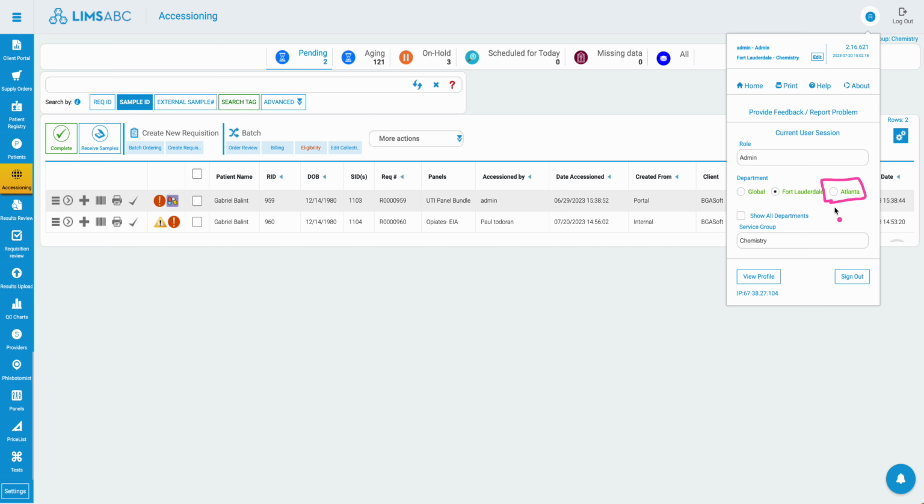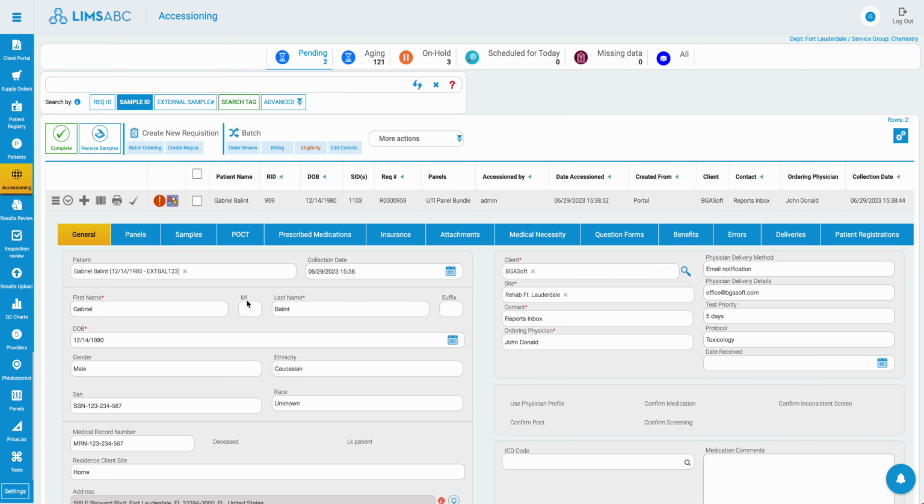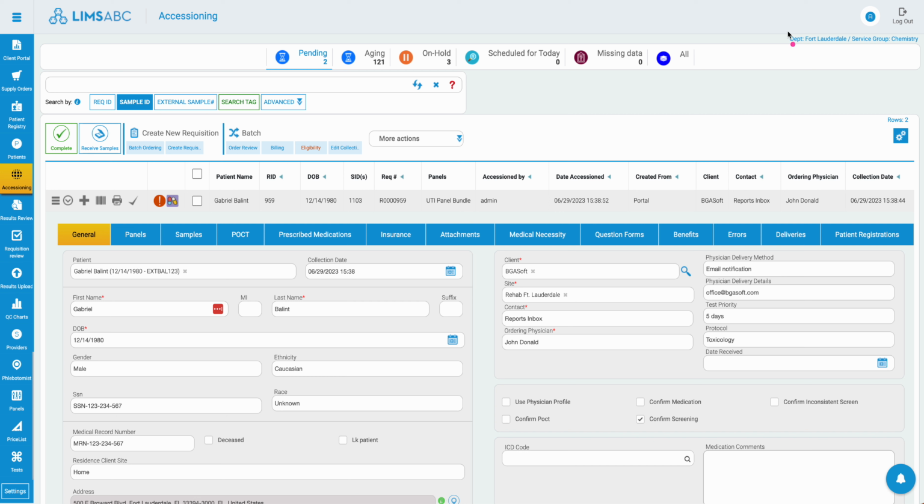So this is an easy way to control that aspect. And this is something that, like I said, we can set up based on different rules automatically, or the user can change manually. If you need to have this functionality, billing interfaces and reports will have to be adjusted to use this owner department for the branding and everything, rather than the analytical department that you can see here, which is the department where the user is physically located and performing his or her job.